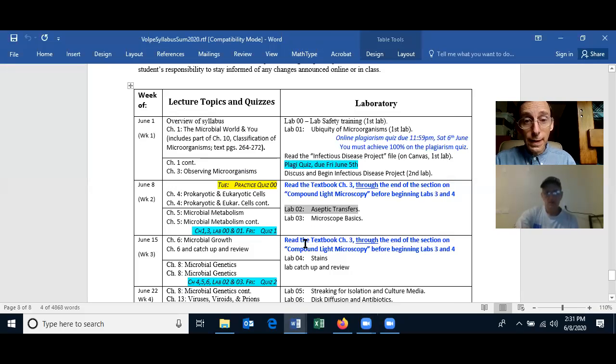So what we're doing today is Lab 2, Aseptic Transfer. Today in the lab, you'll learn how to successfully transfer from one container to another and do it aseptically. And you will be doing it virtually. So please pay attention and watch the videos and all that.